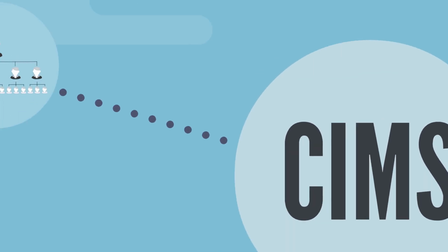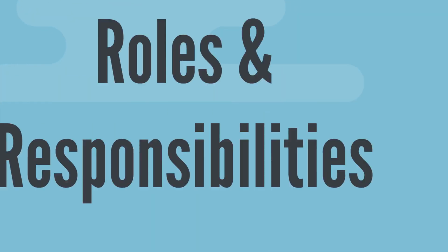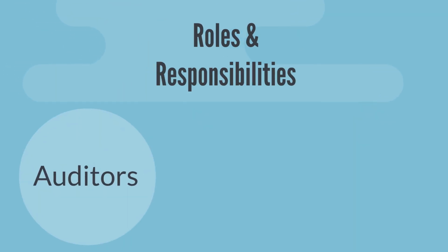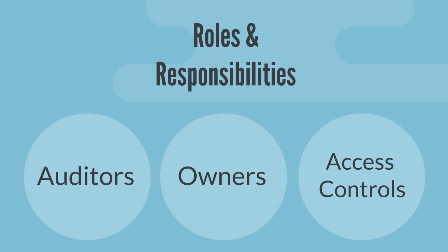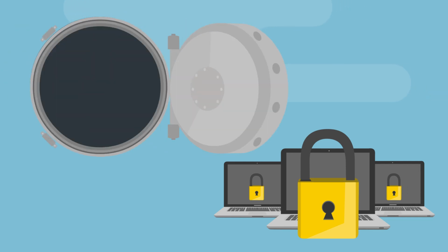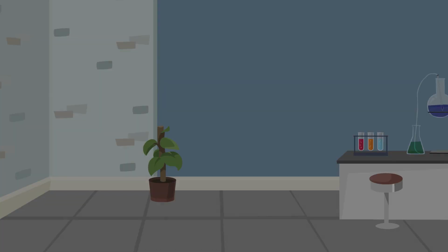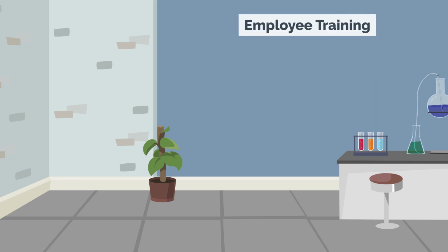Another component is management, personnel, and staff. Upper management support is critical for the longevity of any chemical inventory management system, both procedural and financial. Roles and responsibilities for individuals with access to a chemical inventory system are also important. Access to physical and information assets should be controlled by designating tiers of permissions and security measures, such as physical locks and individual accounts for computer systems. In addition, designated owners need to be assigned and accountable for the security of specific materials and ensure there are no orphan chemicals. The final component is employee training.